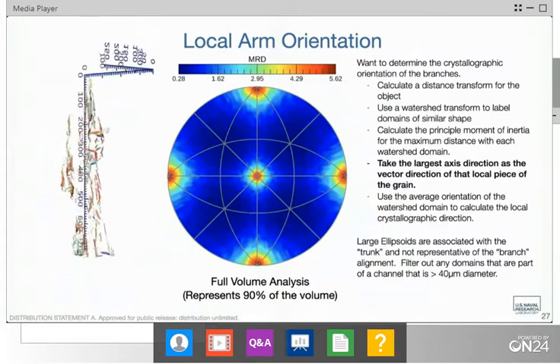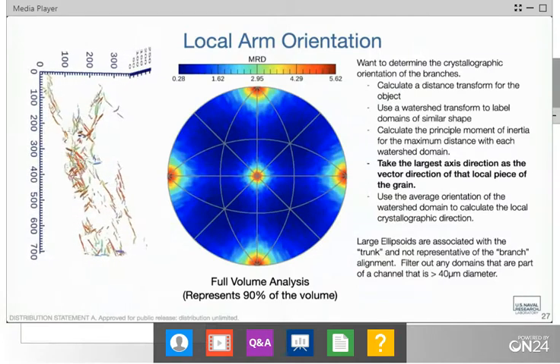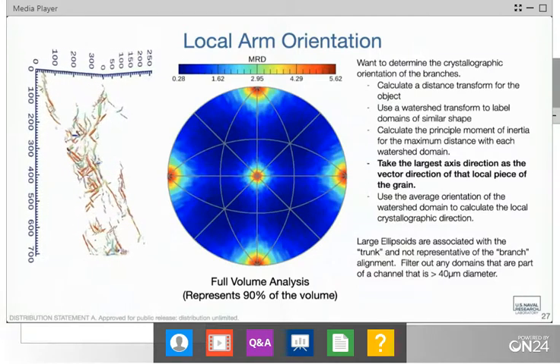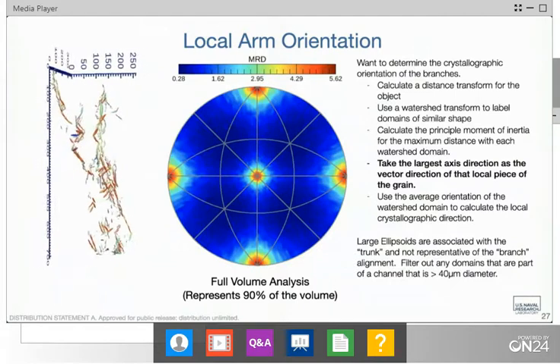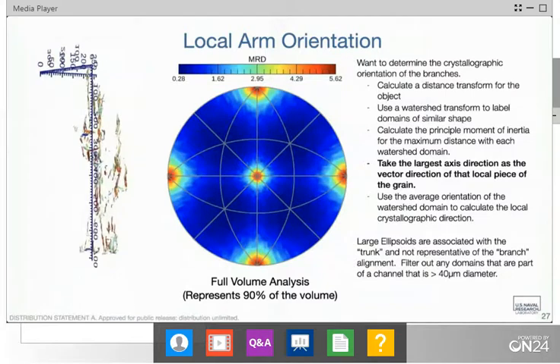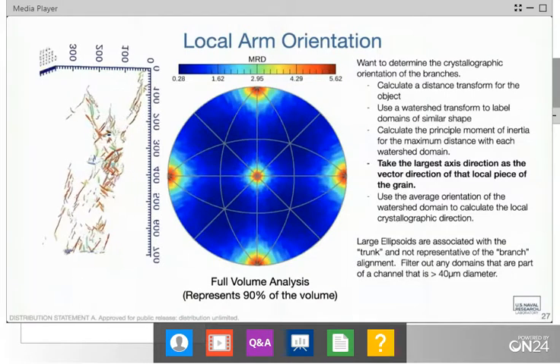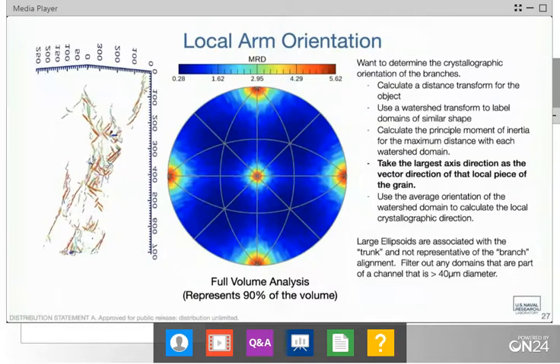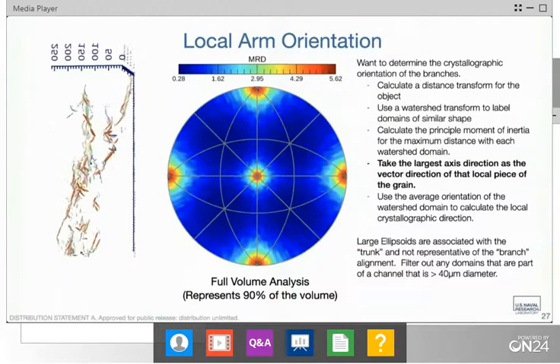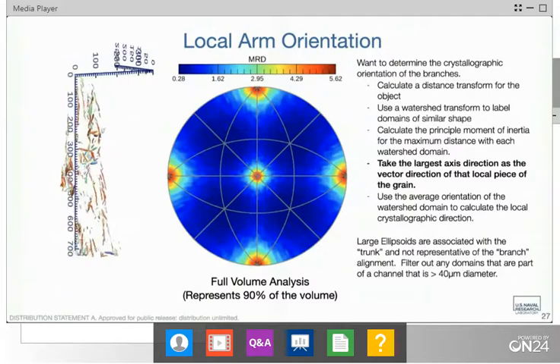But the other thing is that a lot of times we can use the microstructure for alignment. And so the fiducial marks are a handy thing for looking at depth removal, but they aren't as critical for looking at microstructural alignment. So in fact, when we would run over the weekend, we would actually let our indents go away.